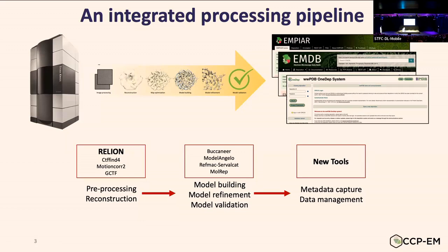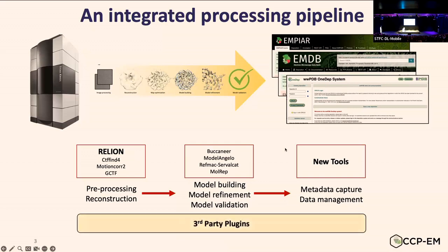So all of these software programs have been chosen to work smoothly together, but at the same time, we're not going to limit what people's choices are. So there's a system for third-party plugins. So the whole thing is modular, and you can cassette in different pieces of software if you don't want to use the ones that we've chosen for various tasks.